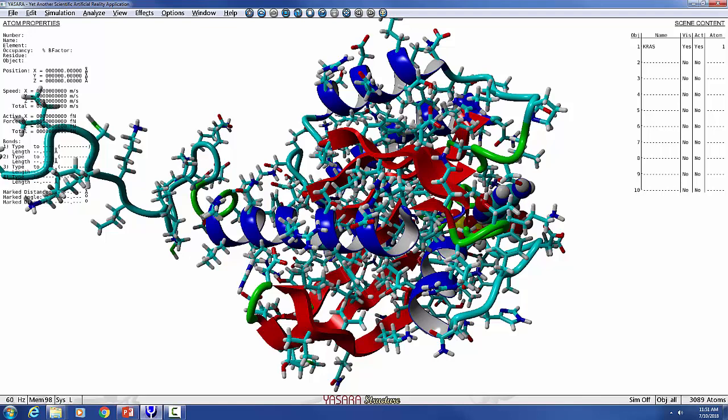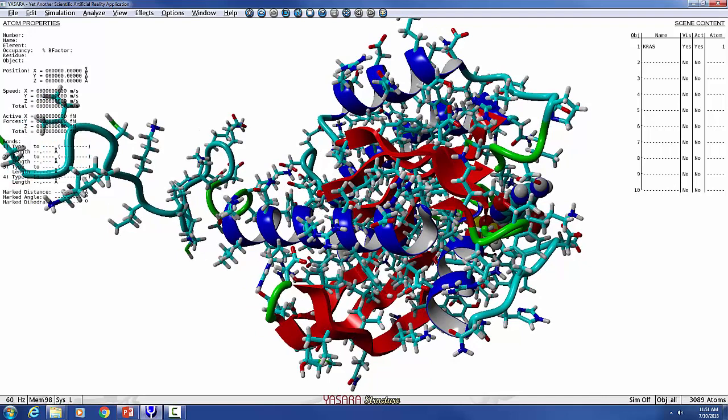Actually, I got this PDB file from a database that one of our colleagues has, and so you can request this and see if we can find the same PDB file for any other protein. We have a limited number of proteins that have been analyzed this way, but we could check, so that might save some work if you need it.